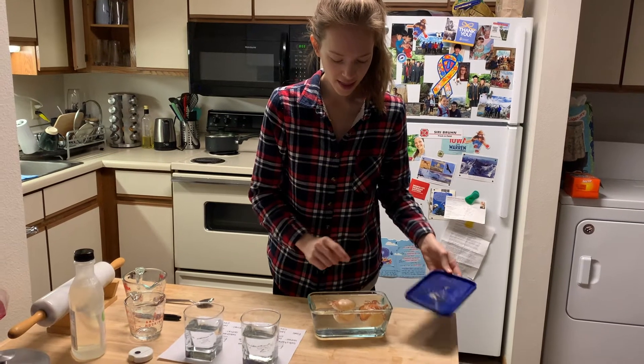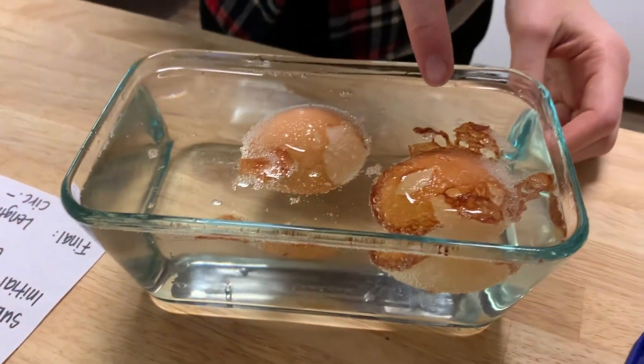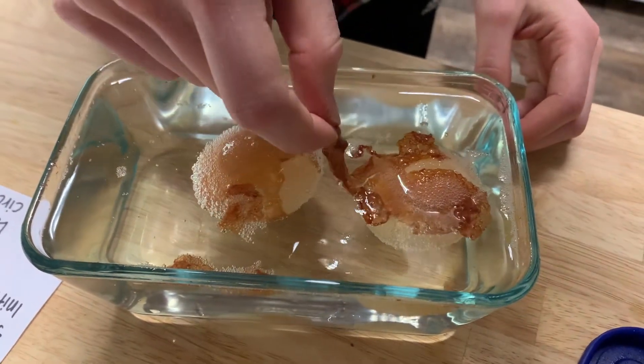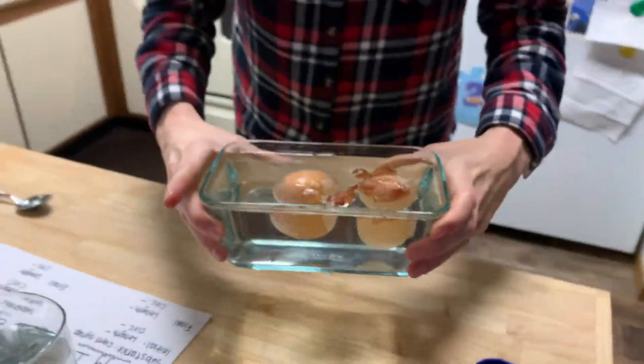Look at these two eggs — look what's happened to the brown shell. The brown shell has almost completely dissolved and we can still touch the eggs, we can even pick up the shell. We're going to take these to the sink and rinse them off.